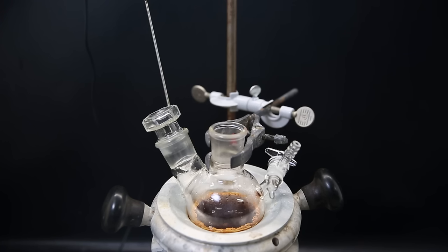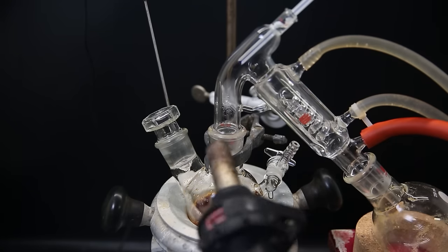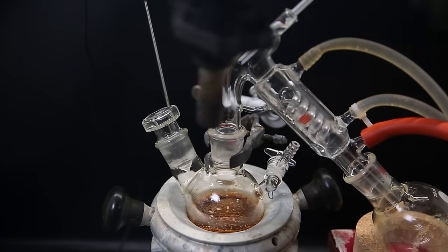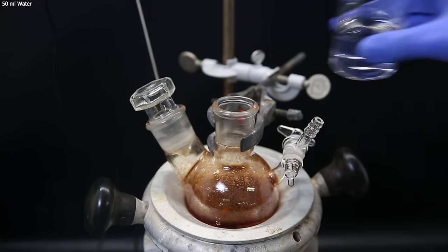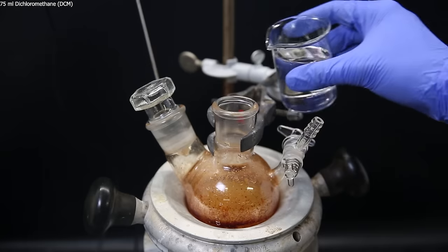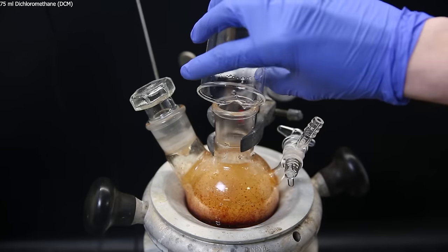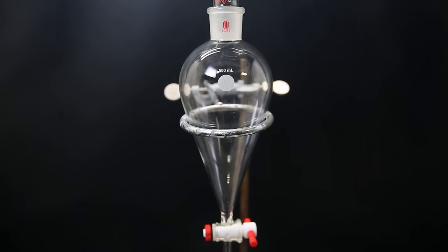I then set the mixture up for short path vacuum distillation to remove all of the liquids. When all of it is gone, a red-orange solid is left behind. I add in 50 mL of water to take up any salts, and then 75 mL of DCM to extract the product. I shake it around to make sure everything dissolves, and then move it all to a separatory funnel.